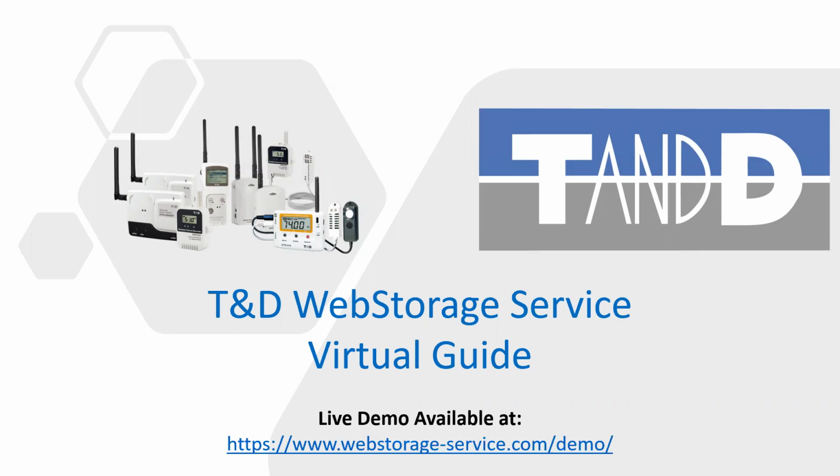Data loggers are used by organizations with safety and preservation in mind. We cover a wide variety of industries such as food and beverage management and transportation, museums, laboratories, gardening and greenhouses, and more. Data loggers monitor environmental conditions and provide for automated, error-free record keeping. Alerting and notification features also help to ensure that the parameters being measured are within acceptable boundaries and do not result in unwanted deterioration and damage.